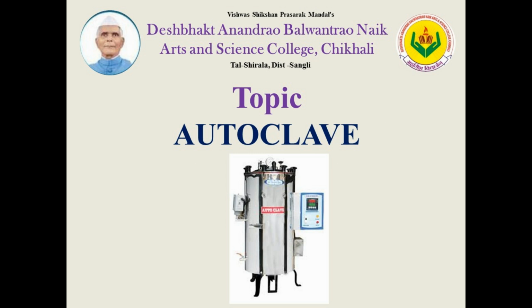Hello friends, today's topic is autoclave. In this topic we will understand the working principle of autoclave and types of autoclave. We will also take a look at biological indicators and their use in calibration.